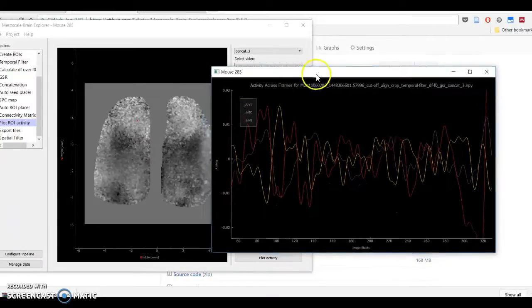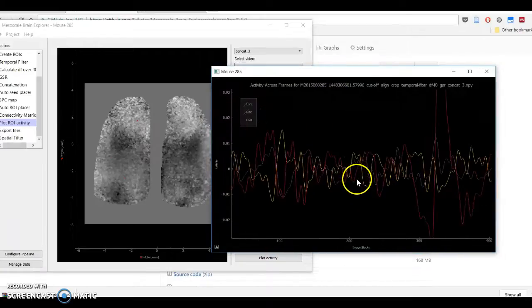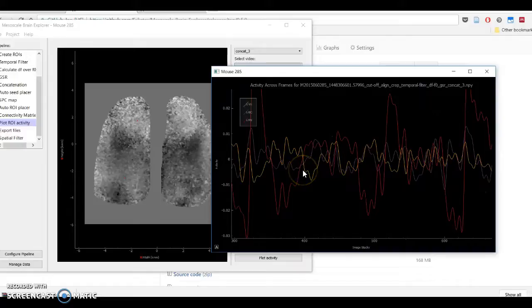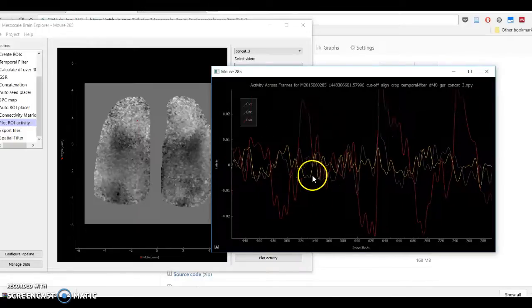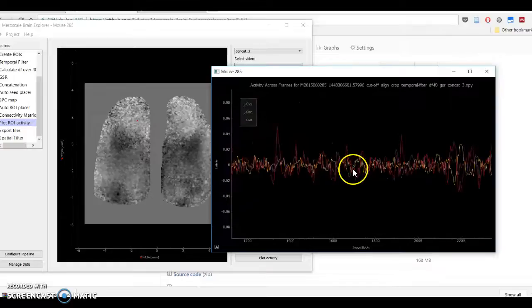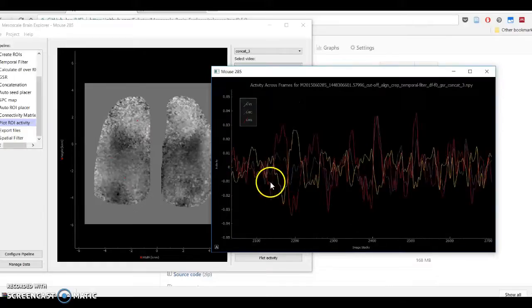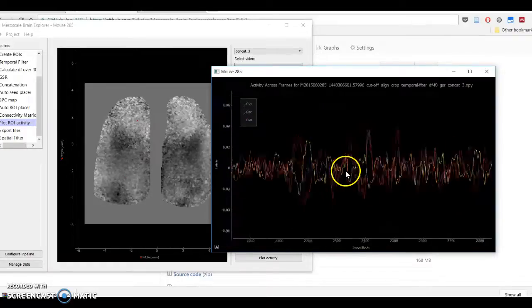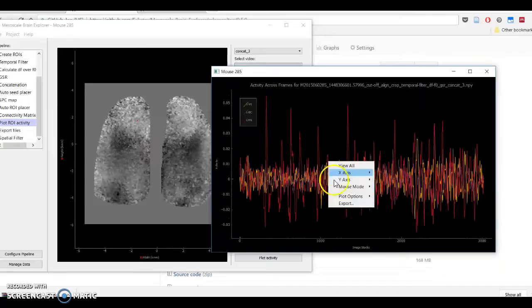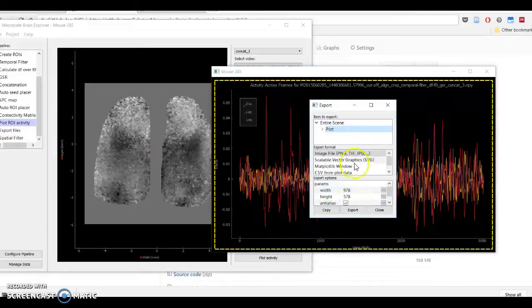And as you should be able to see, at least partially, is a little bit of asynchronous activity between V1 here, BC, and M1. Obviously not the best, as this was a bit of a botched tutorial. But you would see that in, okay, over here we see it much, much better. Okay, so this can of course also then be exported. Oh, there's also the view all, which allows you to just immediately center on that. So this can be exported.